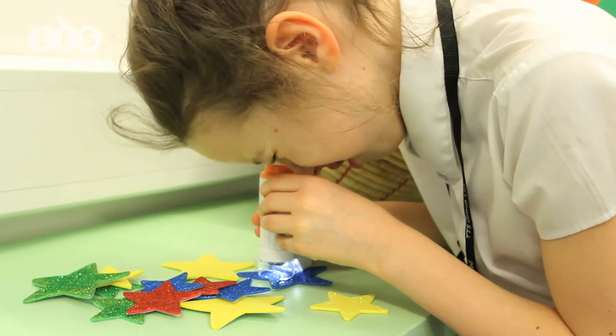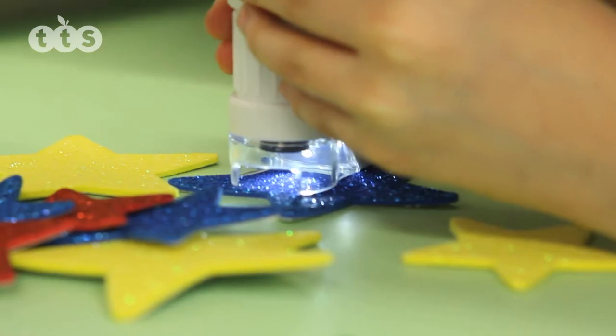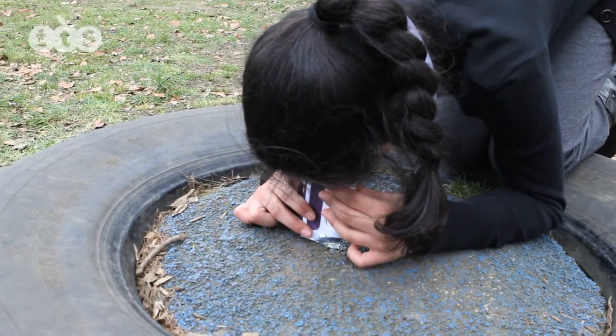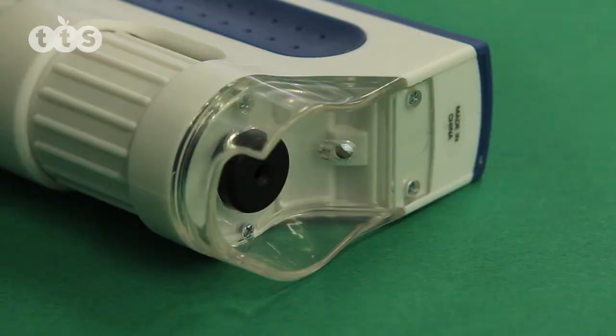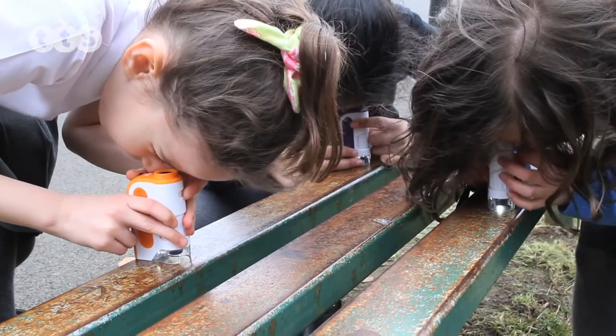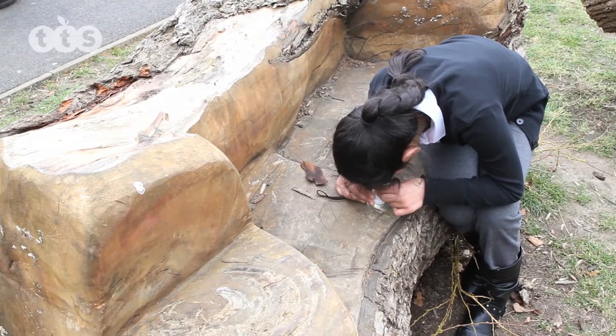They are suitable for children from three years of age, and are robust and easy for small hands to hold and use. They require an AA battery, and have built-in LED lights to illuminate the object being viewed, producing a sharp image with up to 120 times magnification.